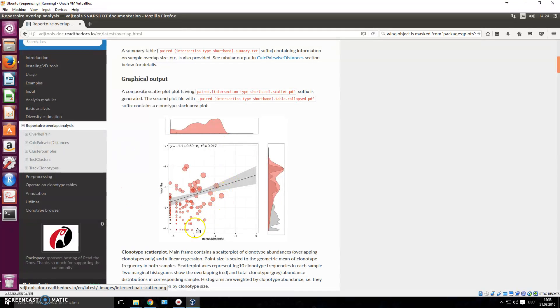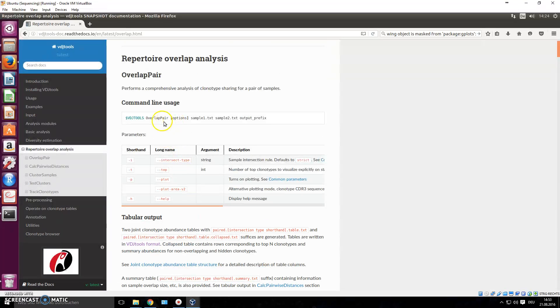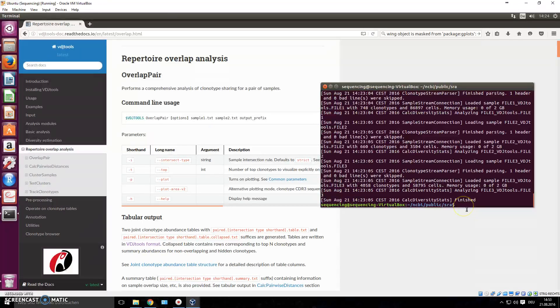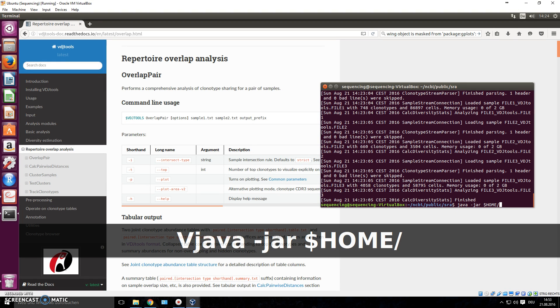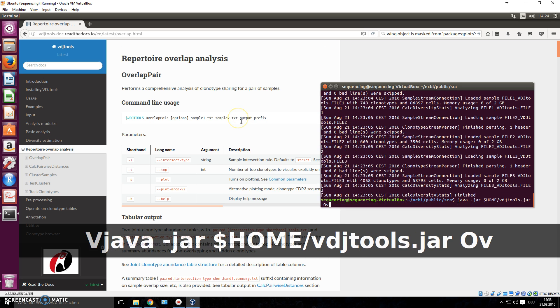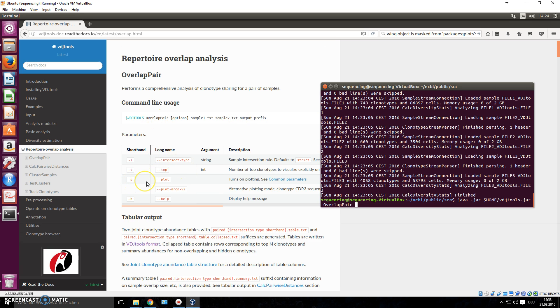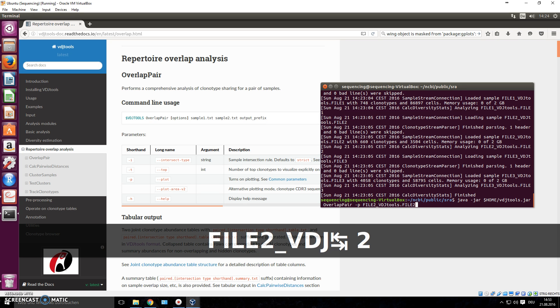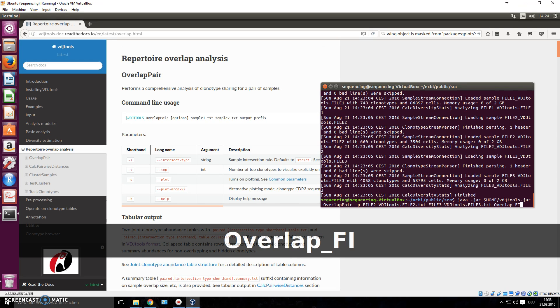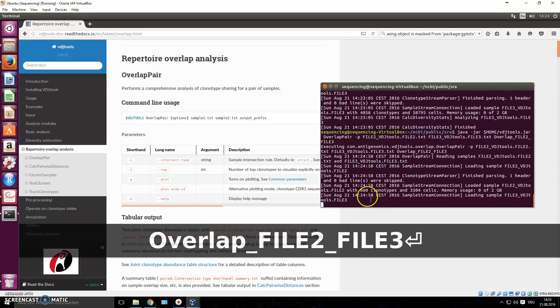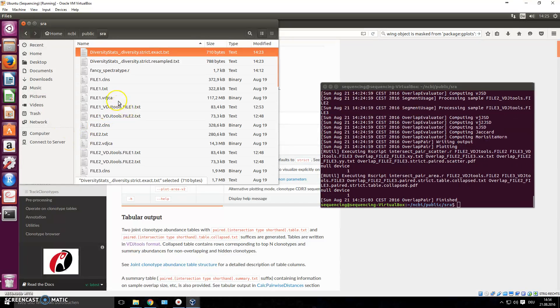There's much more VDJ Tools can do. Repertoire overlap analysis is something I like a lot — it calculates a Pearson correlation and compares two files with each other. You provide just the two samples you want to compare. Type 'java -jar', the path to the jar file, then 'overlap pair'. Turn on plotting with the option, leave everything else at default, and provide file two and file three as inputs with output prefix 'overlap_file2_file3'.